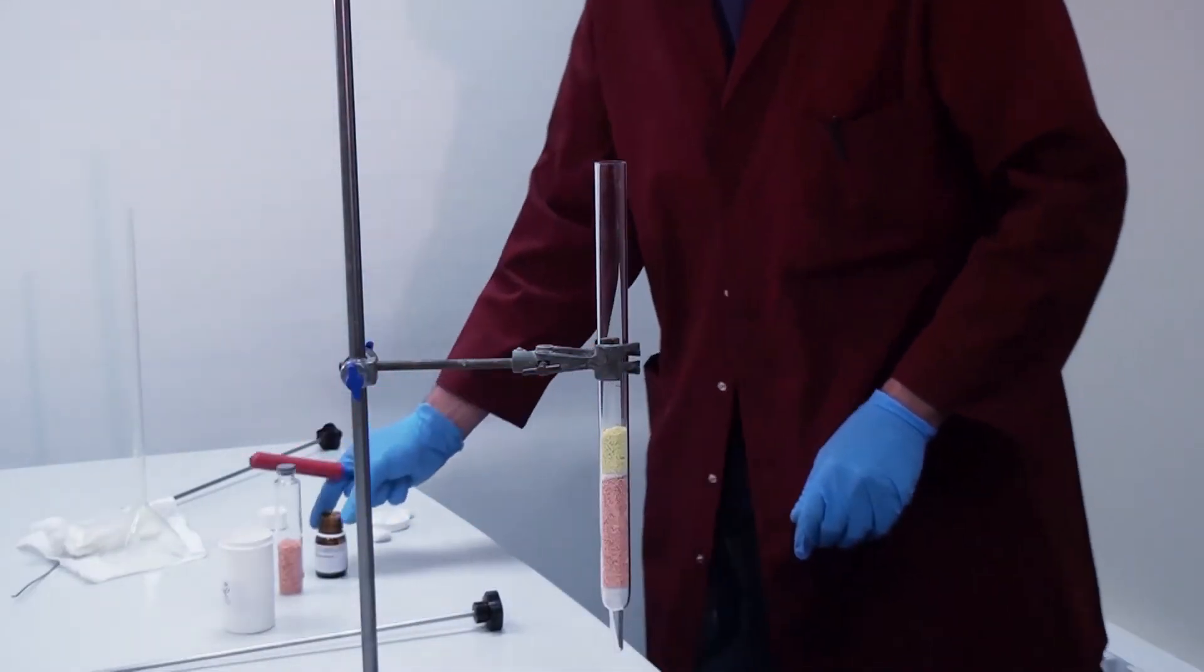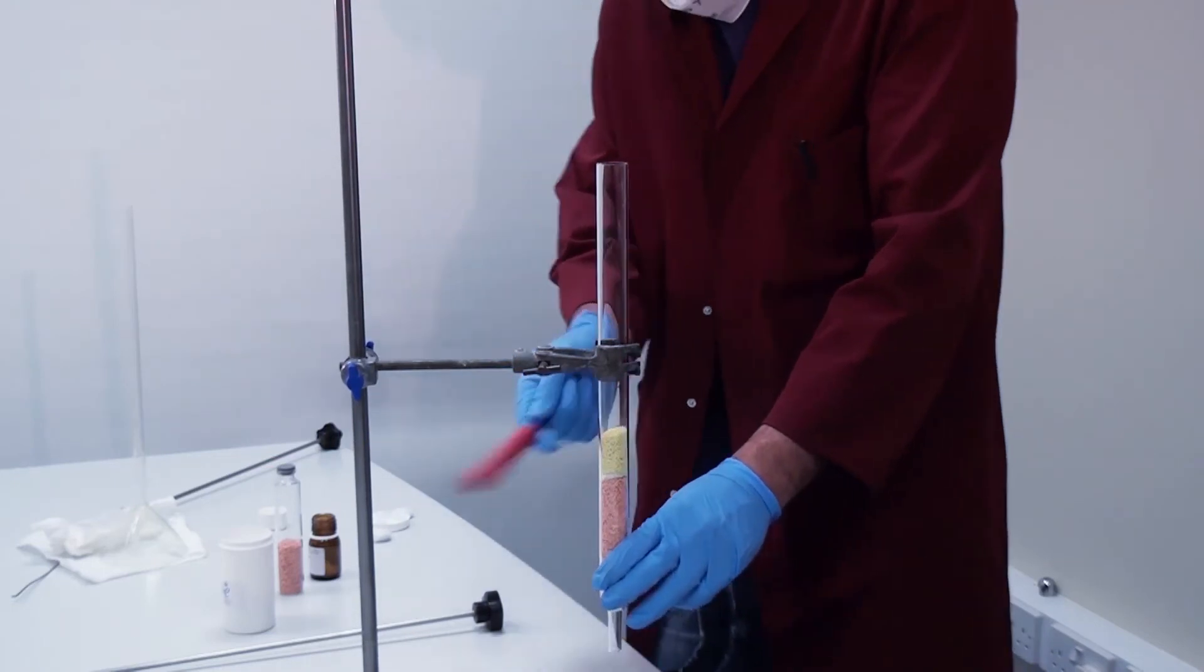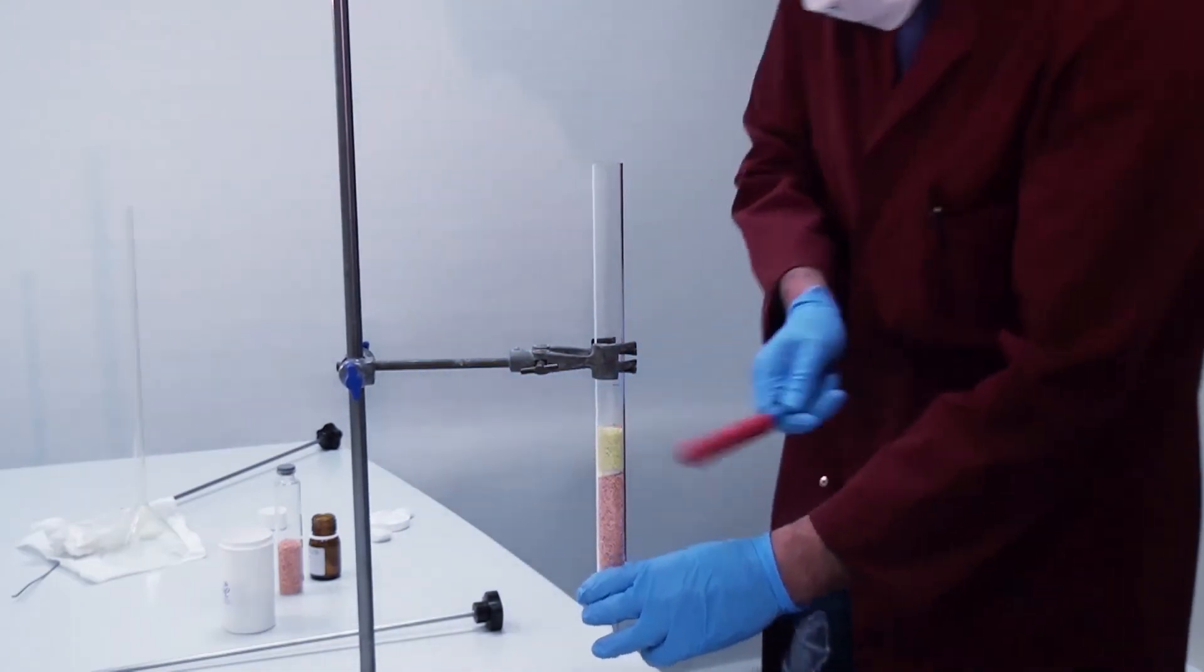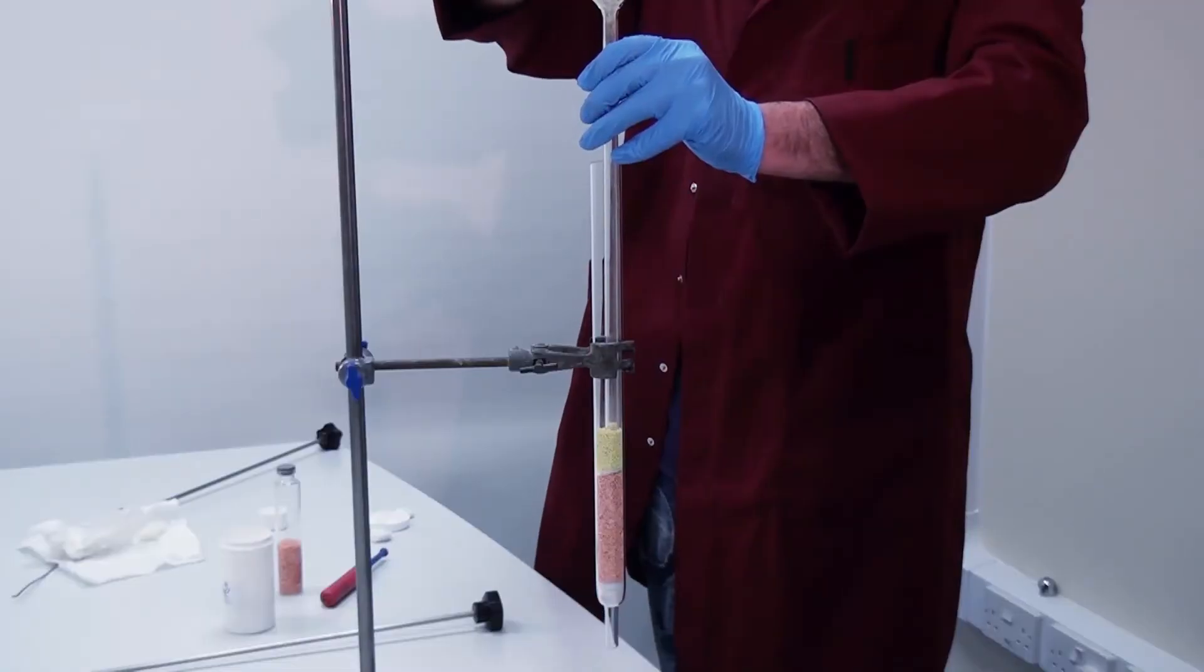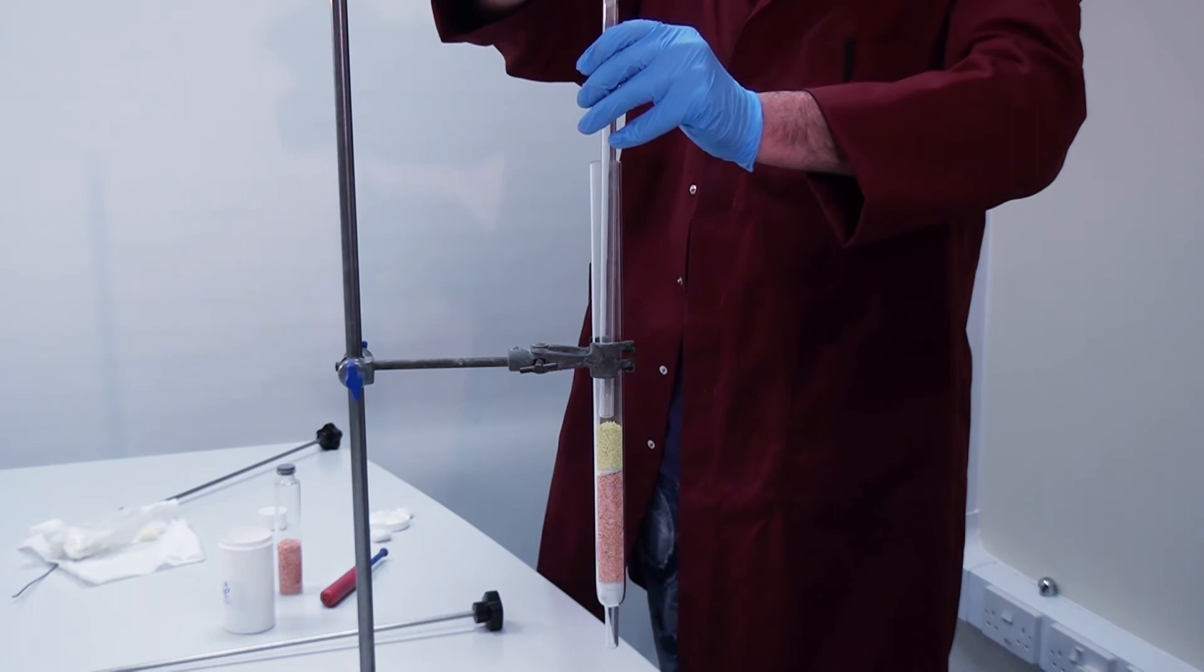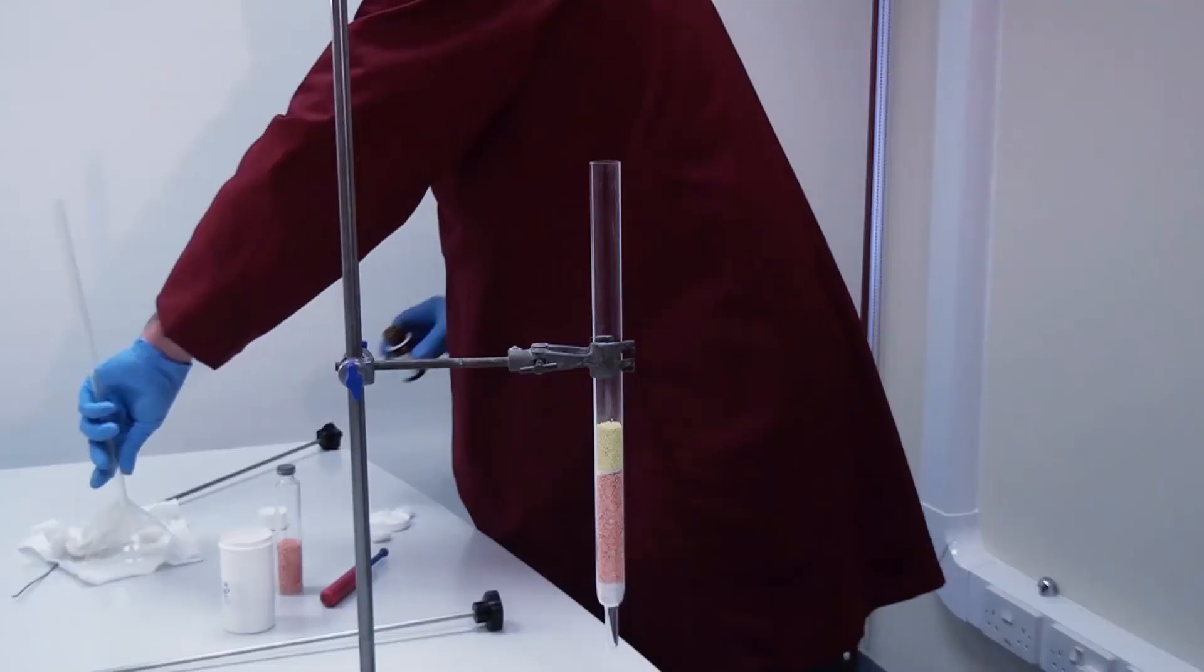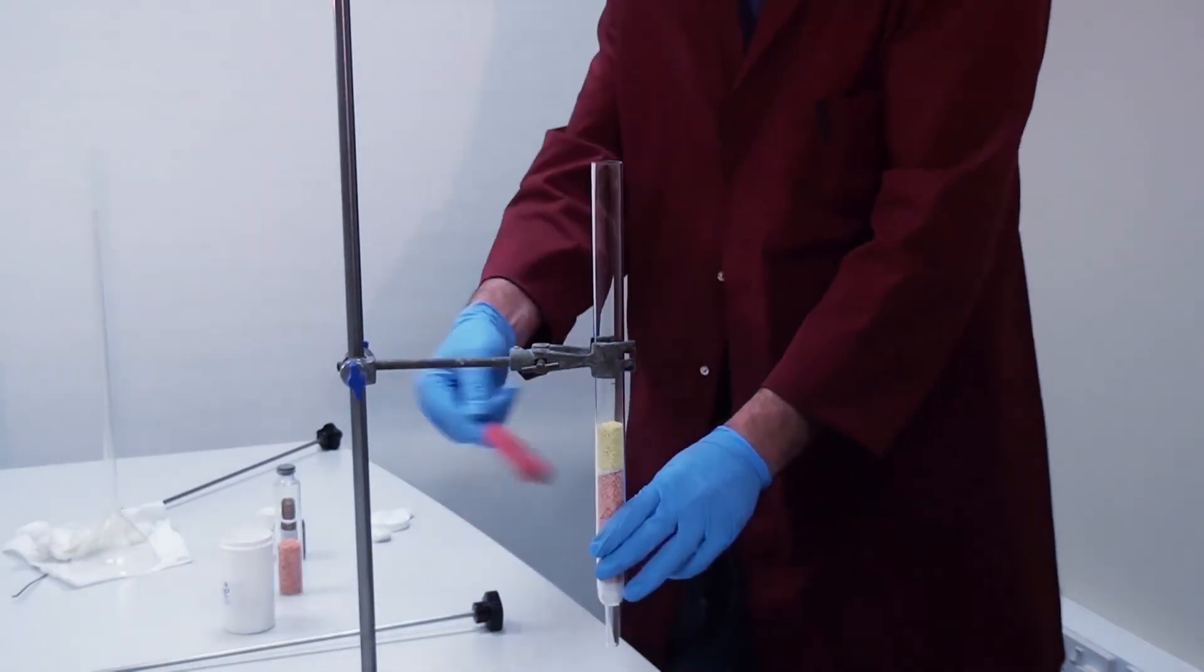Again, tap the tube to settle the reagent. Continue adding and tapping until the next mark is reached.